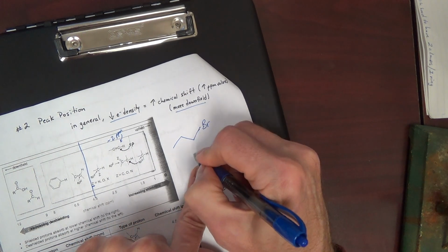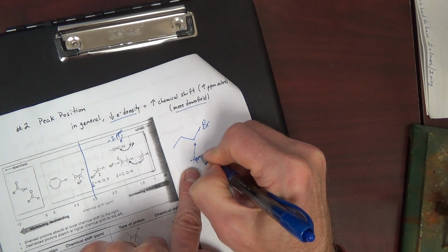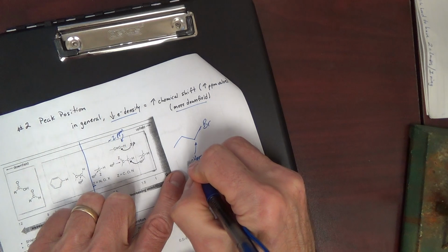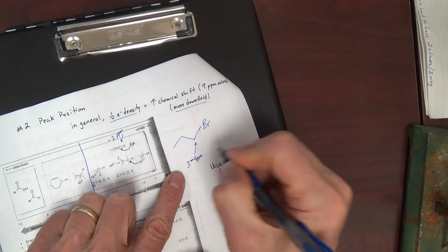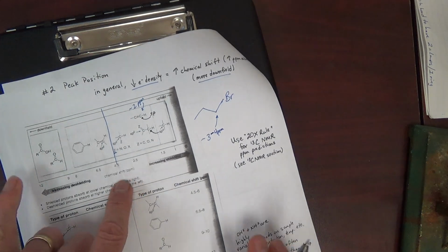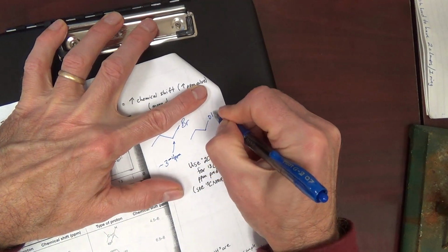These H's here are going to be about 4 ppm, or I'll say about 3 to 4 ppm. Let's broaden it out a little bit to match the table. Or maybe an alcohol.